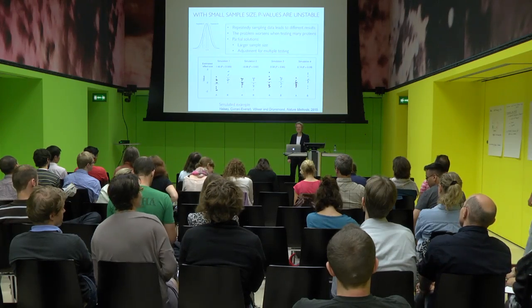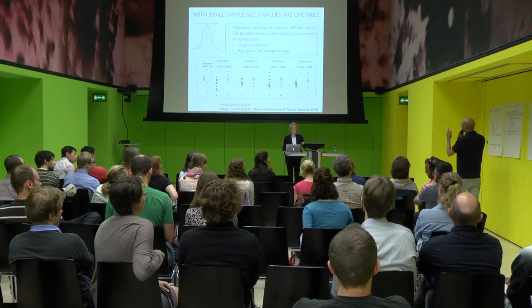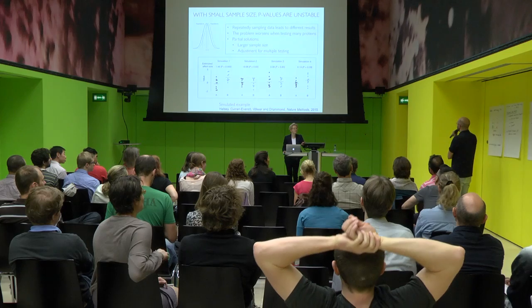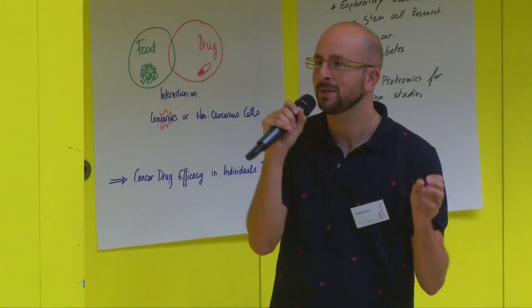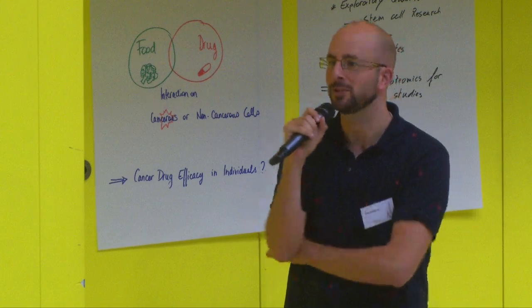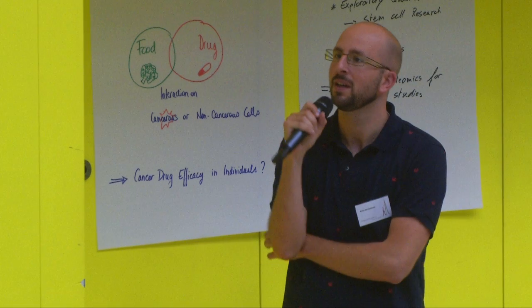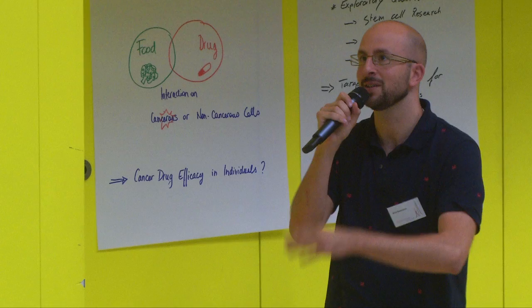Okay. Maybe I'll ask a question, actually. Oh, yeah, please. So I, for example, don't work with disease and healthy. I usually work with cell lines. And then a question that always comes is, should I make one big experiment and let's say 3 plates from each condition in a time course? Should I grow this experiment 3 times? What would you recommend for people that do time courses in cell lines and not healthy and disease?